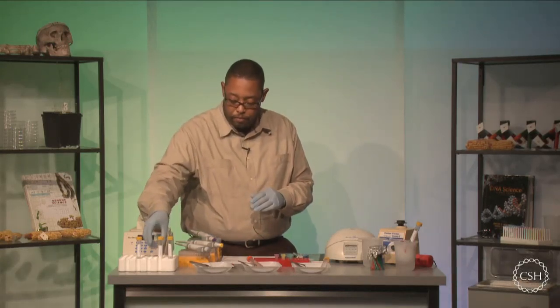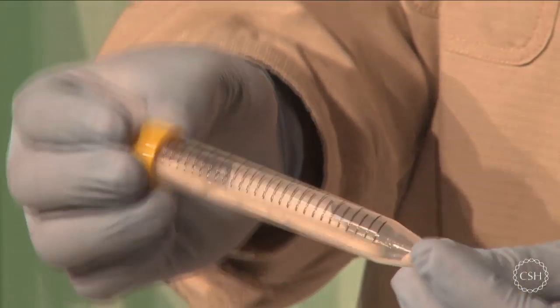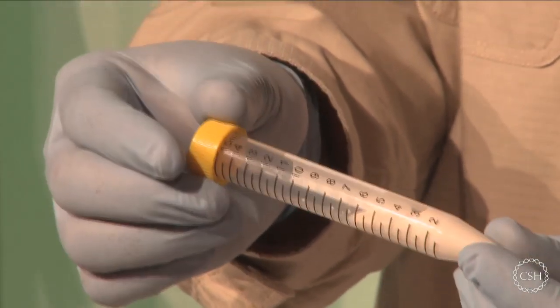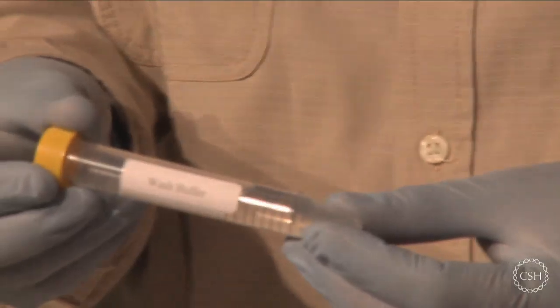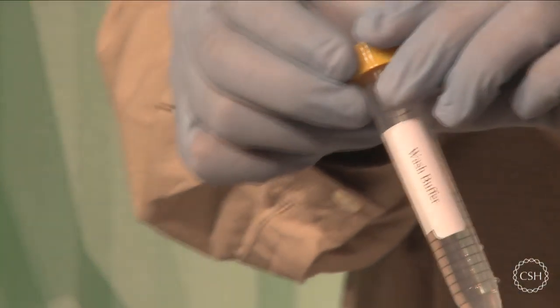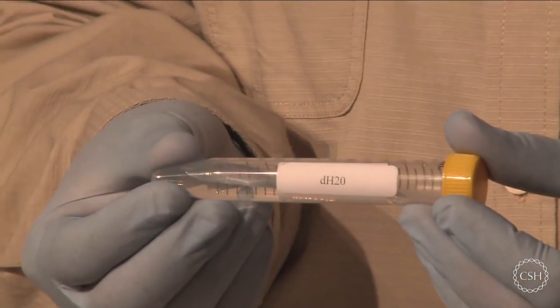I'm also going to have the silica resin physically here, and if you can take a look at this stuff, it's really milky. It looks sort of like buttermilk. This is also known as glass milk, but it's sort of thick, but looks very milky when you're physically in here. Okay. So silica resin will be the second reagent we use. We're going to need wash buffer, which I usually keep on ice. It should be very cold when you do this reaction, so you are going to need some wash buffer for this particular experiment. And then lastly, we're going to need something to elute the DNA off of our silica resin, and we're just going to use distilled water for that. Okay.